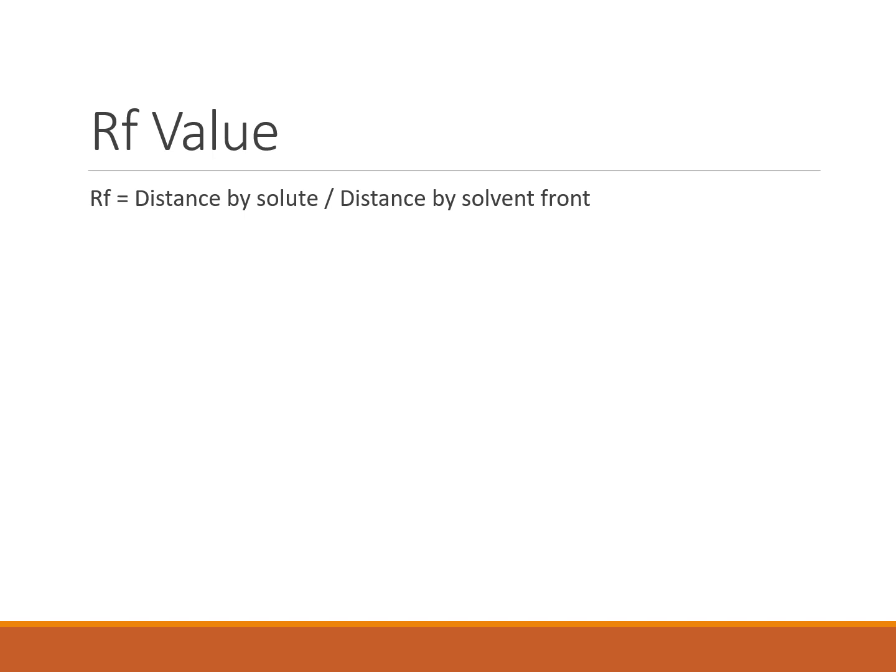The RF is a very important factor. It is a very important parameter. It is termed as retention factor or RF value. It is calculated as the distance traveled by the solute divided by the distance traveled by the solvent front.